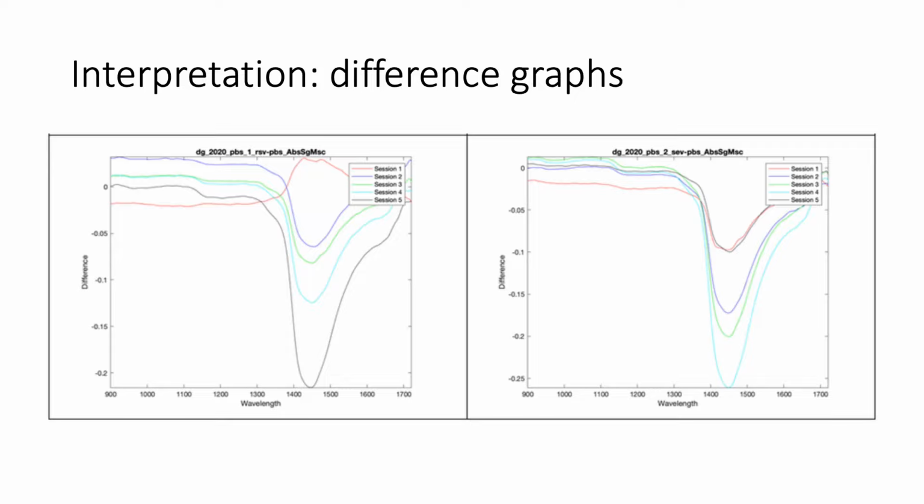And in particular, NIR has been reported to be effective in detecting Zika virus, H7N9, and porcine circovirus type 2. They are typically simple, fast, low cost, so they are suitable for point-of-care deployment. An important question here is, does it work for respiratory virus detection?